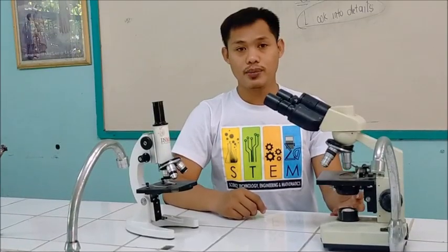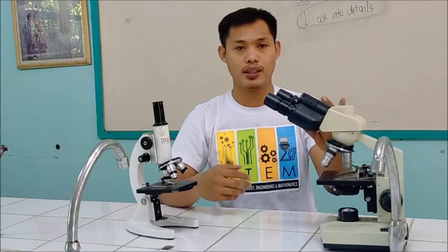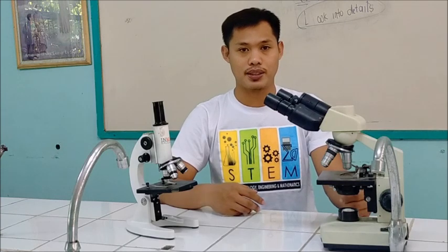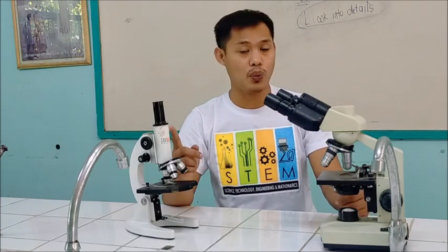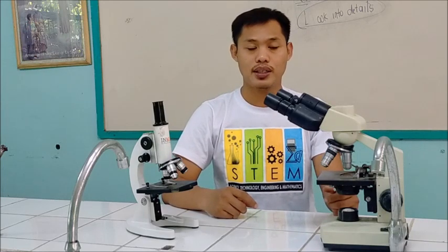So I have here with me two types of microscope. We have the monocular and the binocular microscope. Their difference is the number of ocular lenses, or eyepieces. Monocular contains one and binocular contains two eyepieces or lenses.